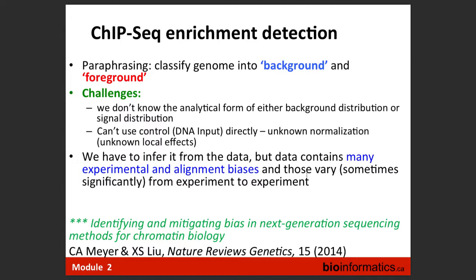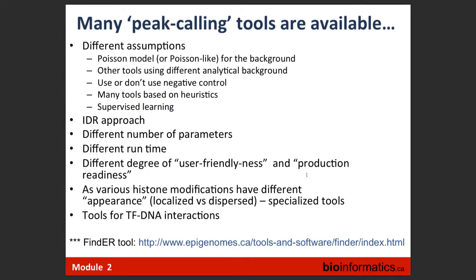It's easy. In ChIP-seq, we have a lot of background. We have a lot of biases coming at every single step, as in one of the first slides we had. And this is a problem, right? We have to decipher: when we have a little bump, is this bump just due to fluctuation of our background, or is it already a significant enrichment? That's what we are doing when analyzing ChIP-seq.